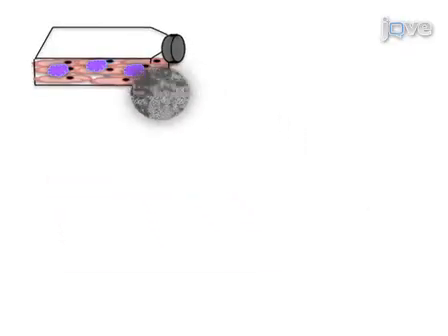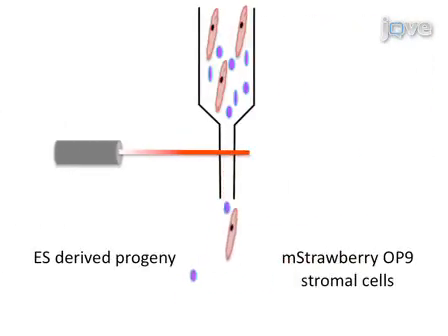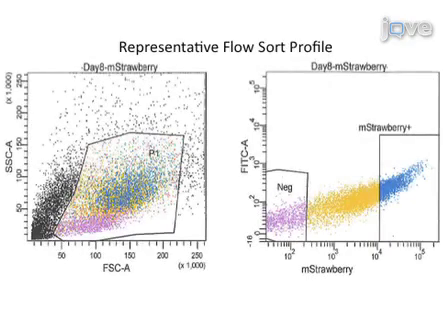With this modified ES OP9 co-culture protocol, ES-derived progeny are M-strawberry negative and can be flow sorted from M-strawberry positive OP9 cells on any day of co-culture for evaluation. Results from a representative experiment are shown here.